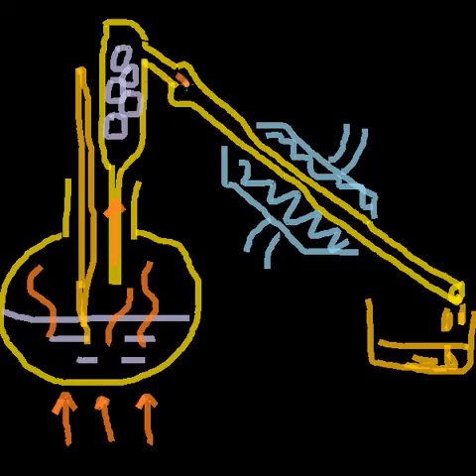And here we might be having droplets of the liquid instead of vapors, and this condenser will further accentuate the process, and if there are any vapors left over, they will get completely condensed over here, and finally the liquid will be collected in this container.